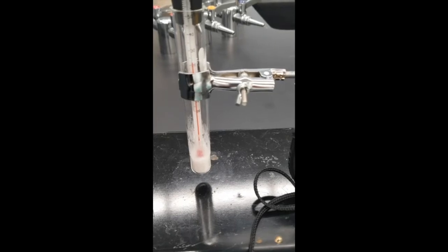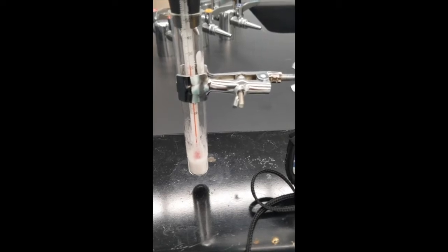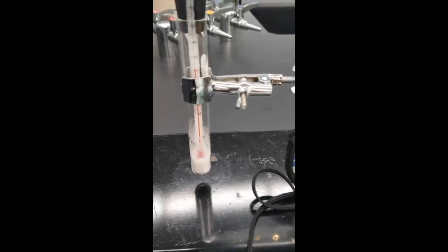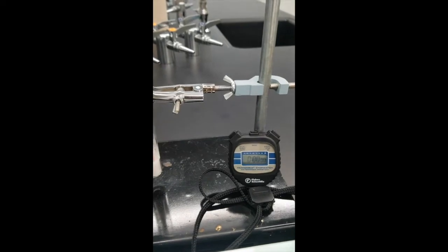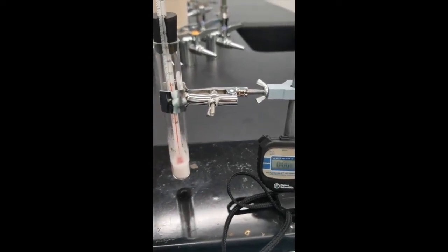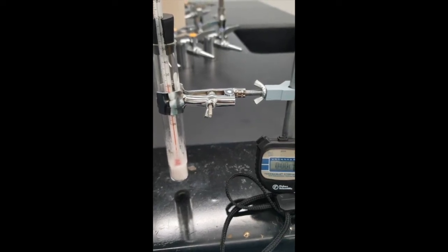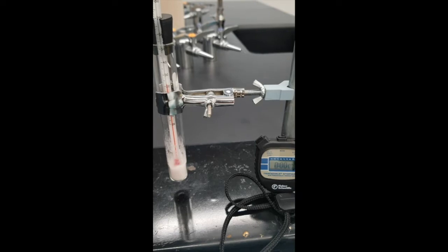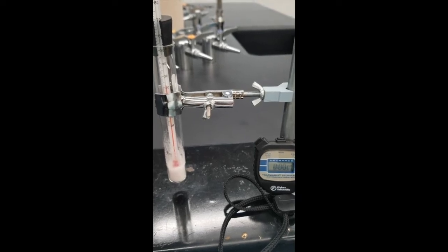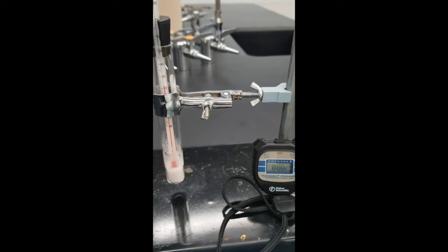We're going to put it into a warm water bath to melt it into a liquid, and then take it out and basically just make a note of the temperature as a function of time while it cools back into a solid. So keep an eye on it. We're going to draw again a graph just like we did before with our heating curve of water, except of course now the temperature should be dropping as a function of time.